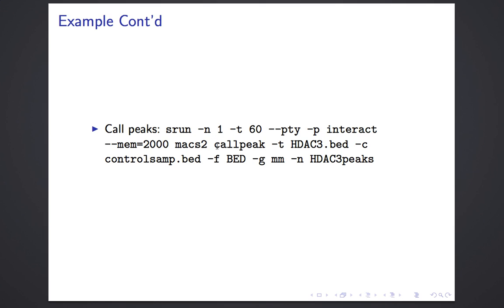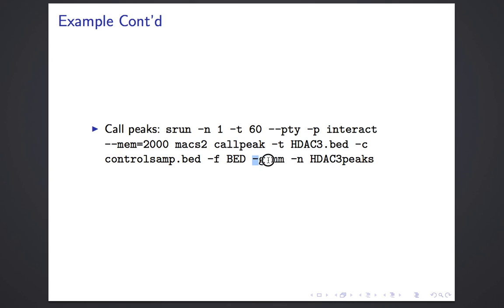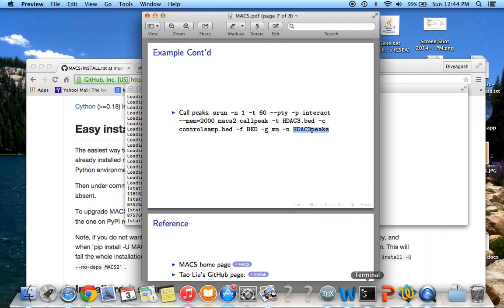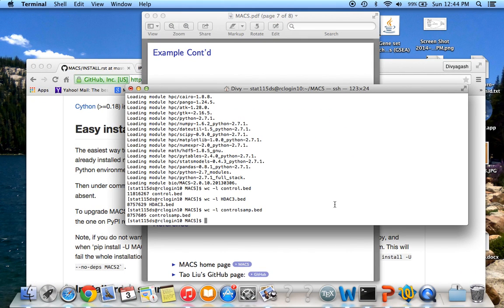To call peaks I use the callpeak command, specifying my treatment file, my control file, the format of the file which is BED format, the size of the genome, and the stem name for the output files.